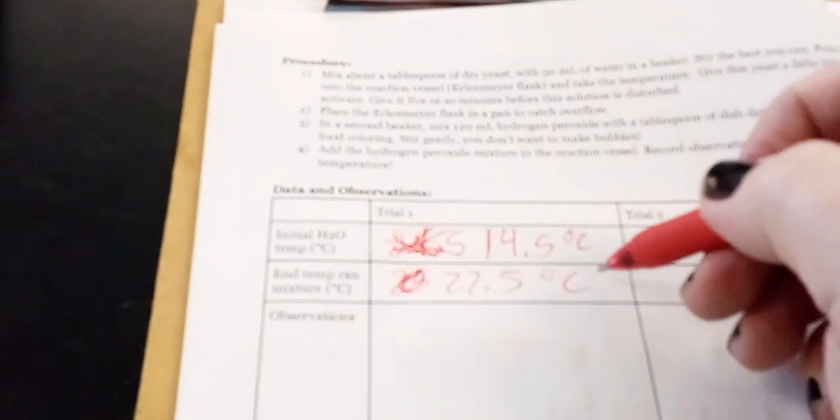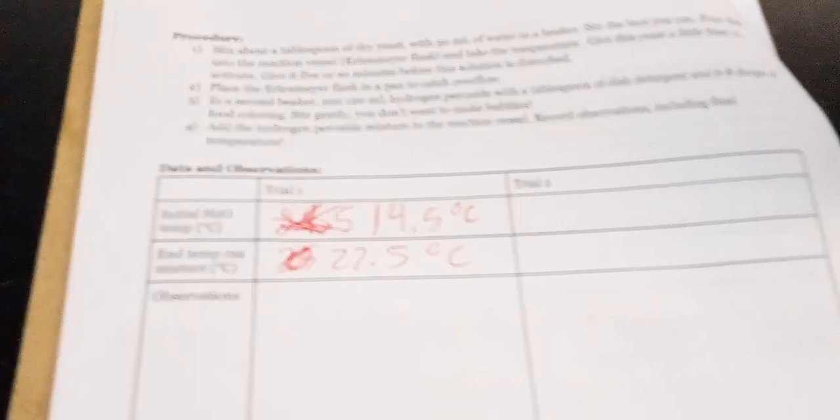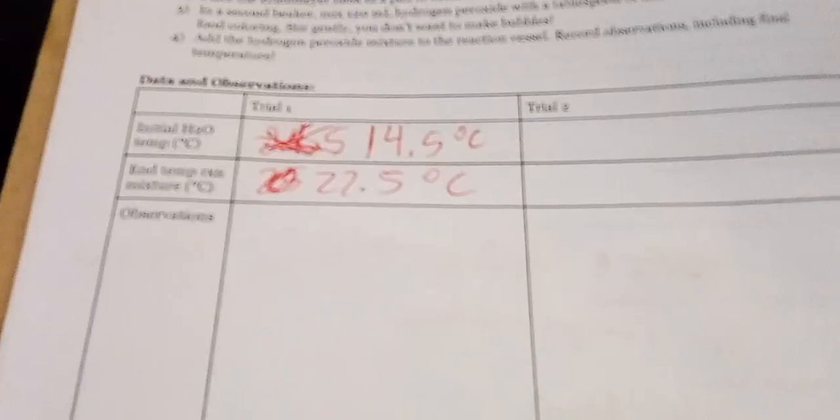So this increase in temperature proves that the reaction is exothermic. That's what you will expect in an exothermic reaction. Heat is going to be released from the system, which is hydrogen peroxide, and it's increasing the temperature of the surrounding water in the system.